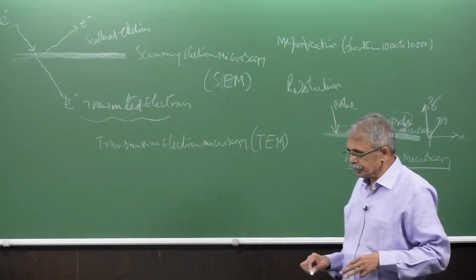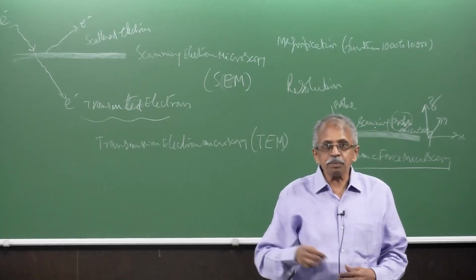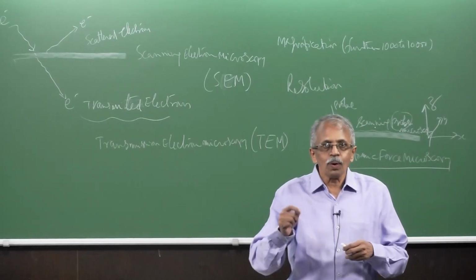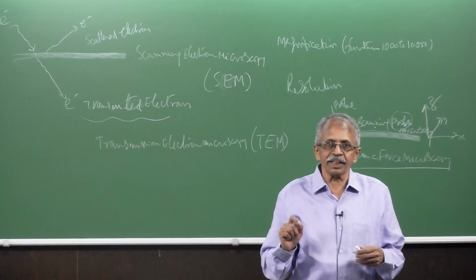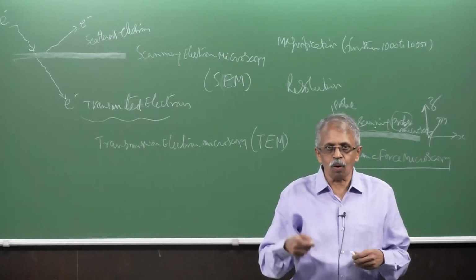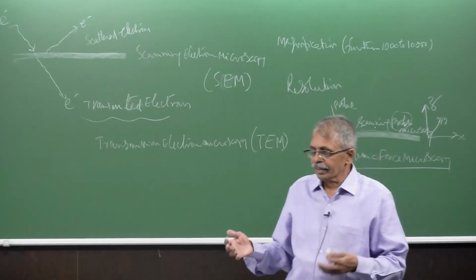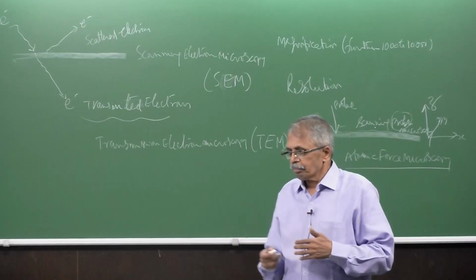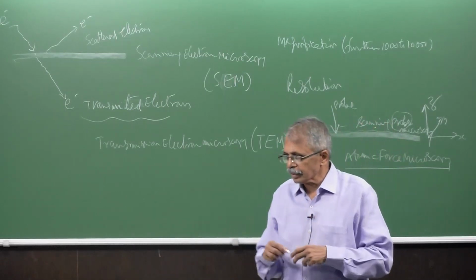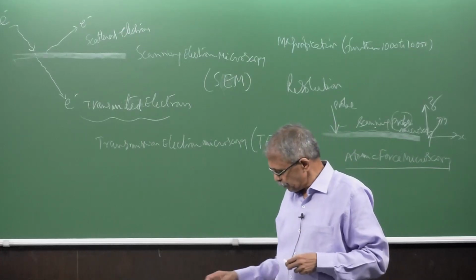And if you change the chemical species, the probe movements, reactions and outputs will also change. Therefore you can see something is different from the other, through the force between that species, that atom, that surface and the tip. So that is scanning probe microscopy.